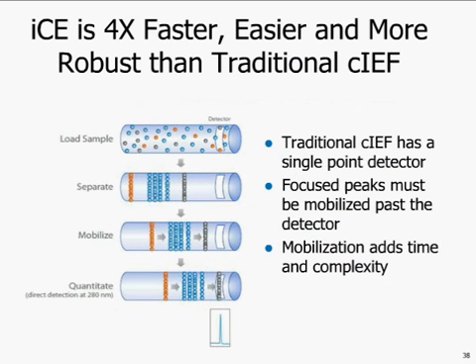CIEF presents a unique challenge to traditional CE systems, which are designed to handle moving peaks. Nearly stationary, the focus bands require a mobilization technique for peak detection. As you will see, the mobilization techniques, though effective, are not without their disadvantages.